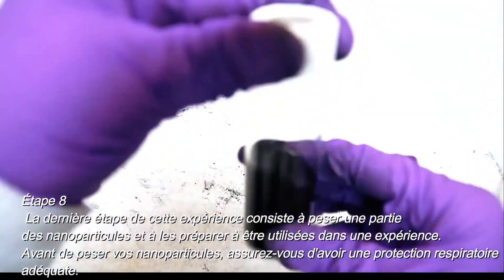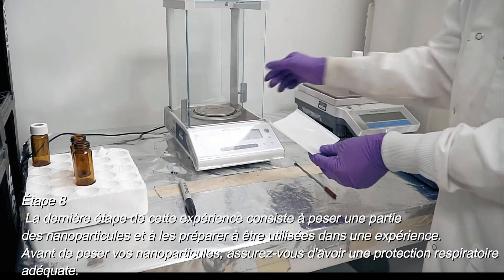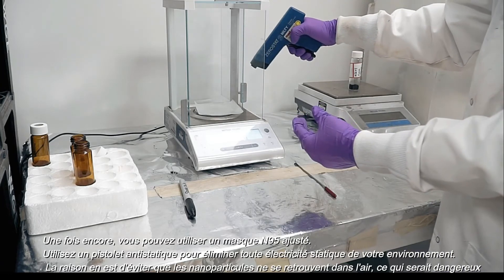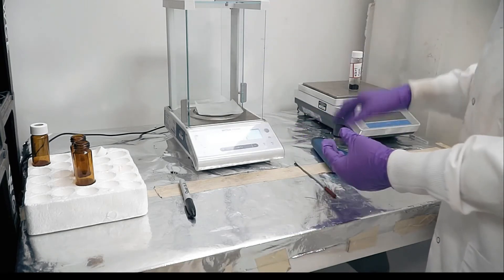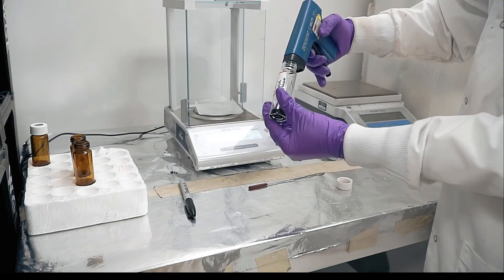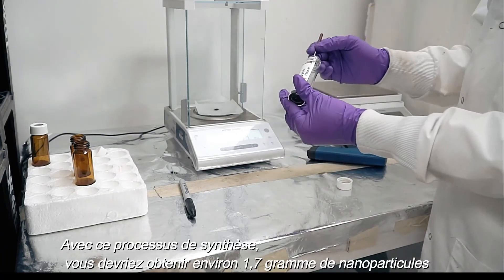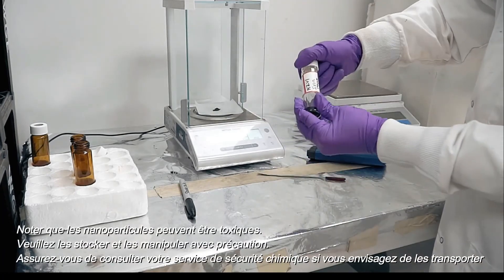Step 8: now it is finally time to use your nanoparticles in an experiment. Before weighing your nanomaterial, make sure you have the proper respiratory protection — again, you can use a fitted N95 mask. Use a static gun to remove any static electricity from your environment. Without this process, your nanomaterials may become airborne and create a hazardous condition. With this synthesis process, you should get approximately 1.7 grams of nanoparticles. Please note that nanoparticles may be toxic, so store and handle them carefully.